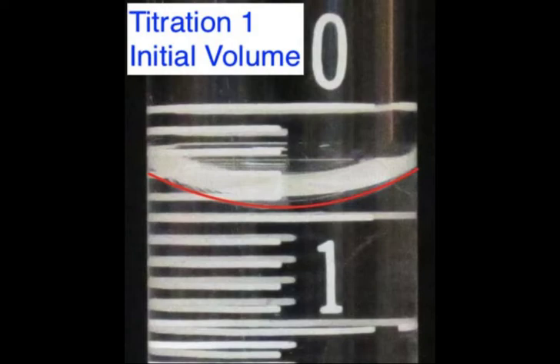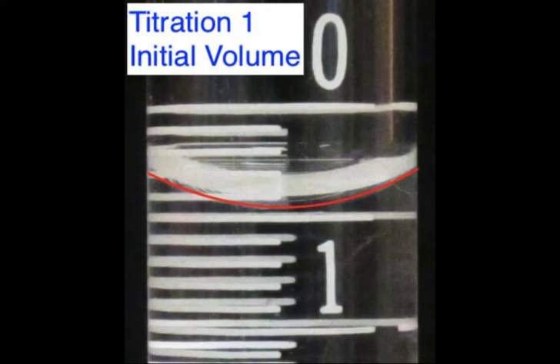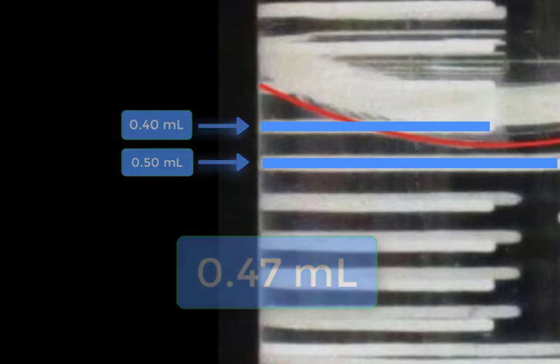Now notice how the burette is laid out. It's different than a graduated cylinder, which we've all had experience with. You're starting at 0 milliliters up top, and the volume is increasing as you go down. And what you have to realize is that each line there, as you're dropping down on the burette, it's actually counting up on the volume. So again, each line you're going from 0 to that mark is 0.1 to 0.2 to 0.3 milliliters, and then 1, 2, 3, etc., which you can't see. So this particular measurement, where the bottom of that red meniscus is, notice that it's just past the 0.4 milliliter mark. It's not quite to the 0.5 milliliter mark. It's a little bit more than halfway between those two marks. I would call this 0.47 milliliters, 0.48 milliliters. And that's the value that you would want to record on your report sheet.